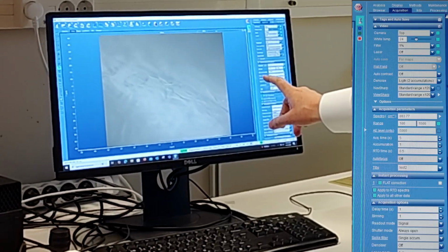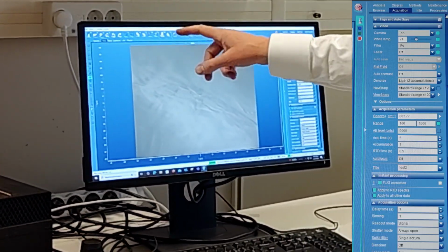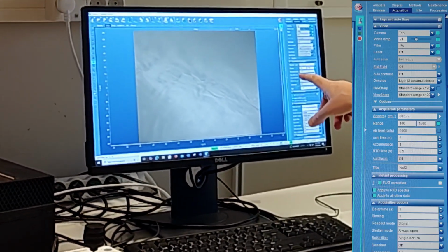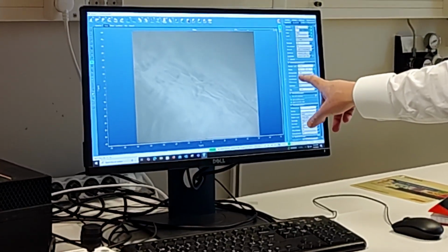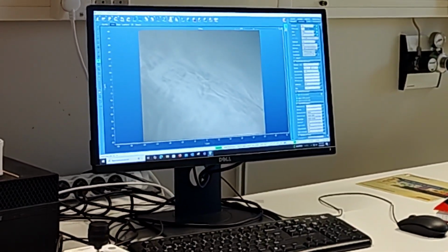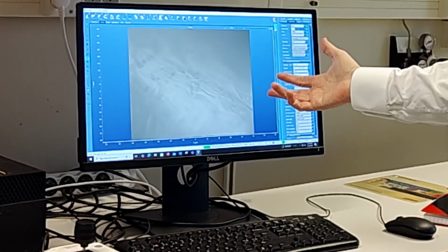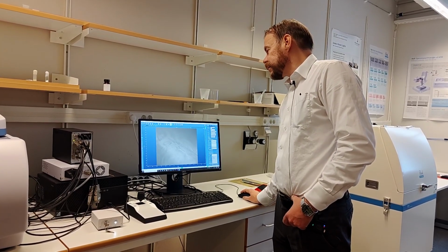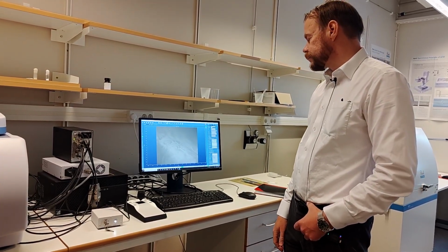And then I can see here it says acquisition time, so there are 2 times. RTD time is for that real-time signal. Acquisition time is for when we actually want to acquire a real spectrum, and usually we don't want that to be half a second and so on. But to get some estimate of how long I should scan, one way to do it is to click the play button and just see how strong the signal is.